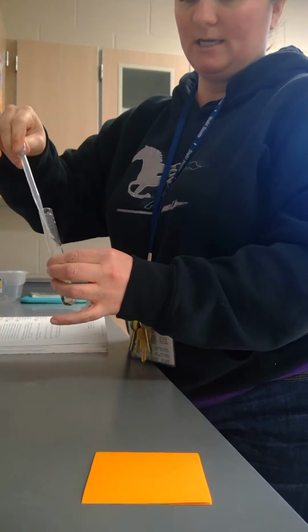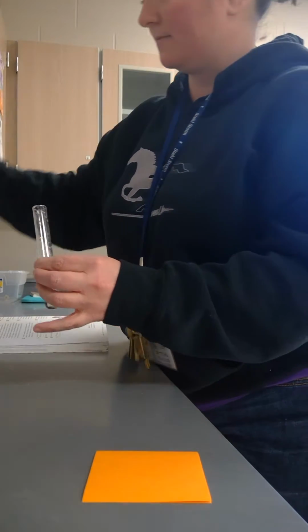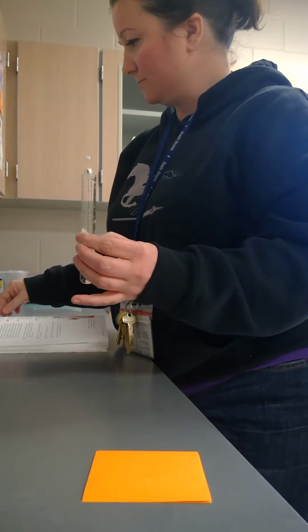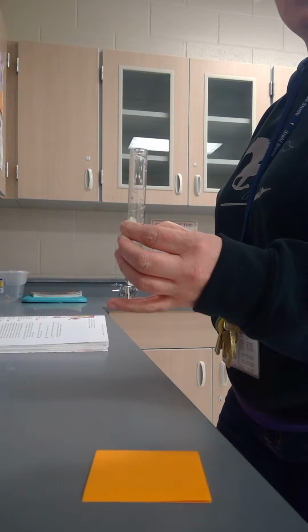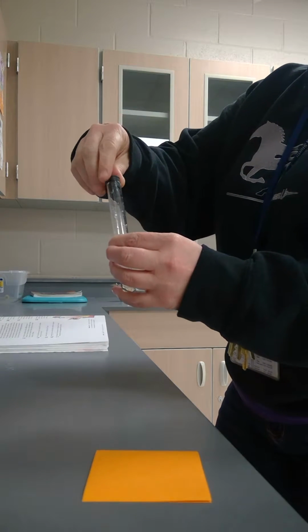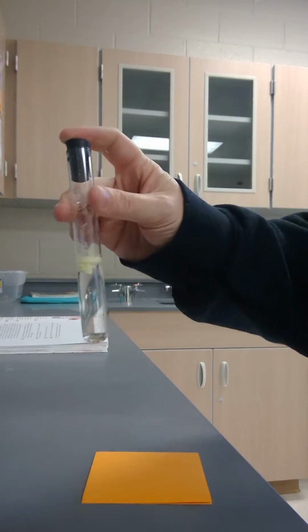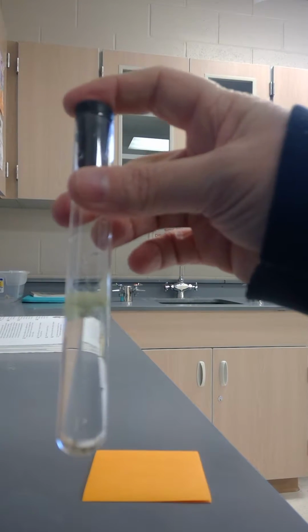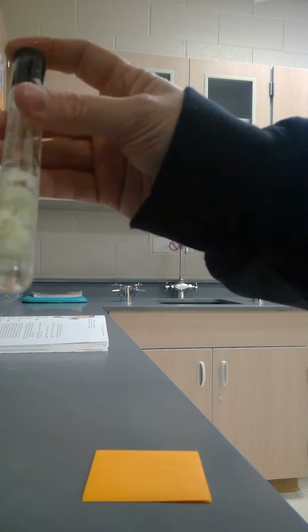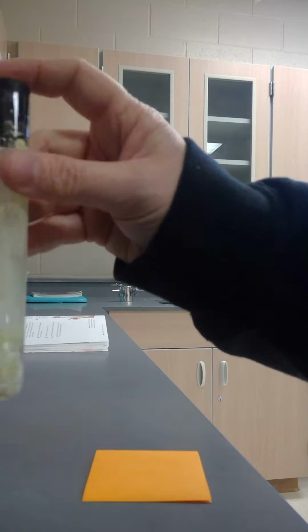We want to find out, is our sulfur soluble? Now, thinking of our vocabulary terms, I want you to think about the solvent. I want you to think about the term solution. And again, I'm going to go ahead and mix. You can see what it looks like prior to mixing. That sulfur is floating on top. And here we go. 1, 2, 3, 4, 5, 6, 7, 8, 9, 10.